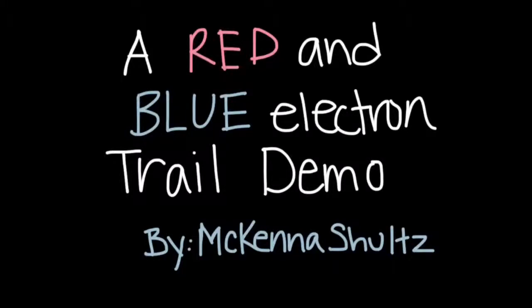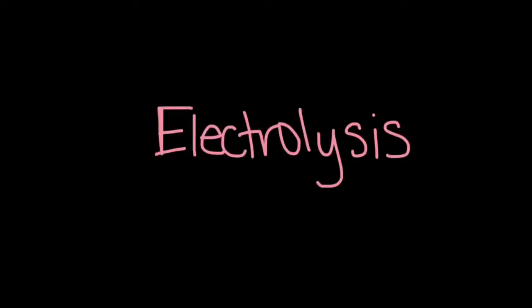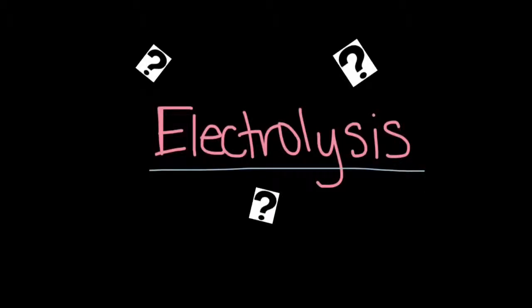Today we're going to be exploring the science behind electrochemistry. Essentially, all this demo really is setting up an electrolytic cell and allowing electrolysis to take place. But what exactly is electrolysis, and how does it work?